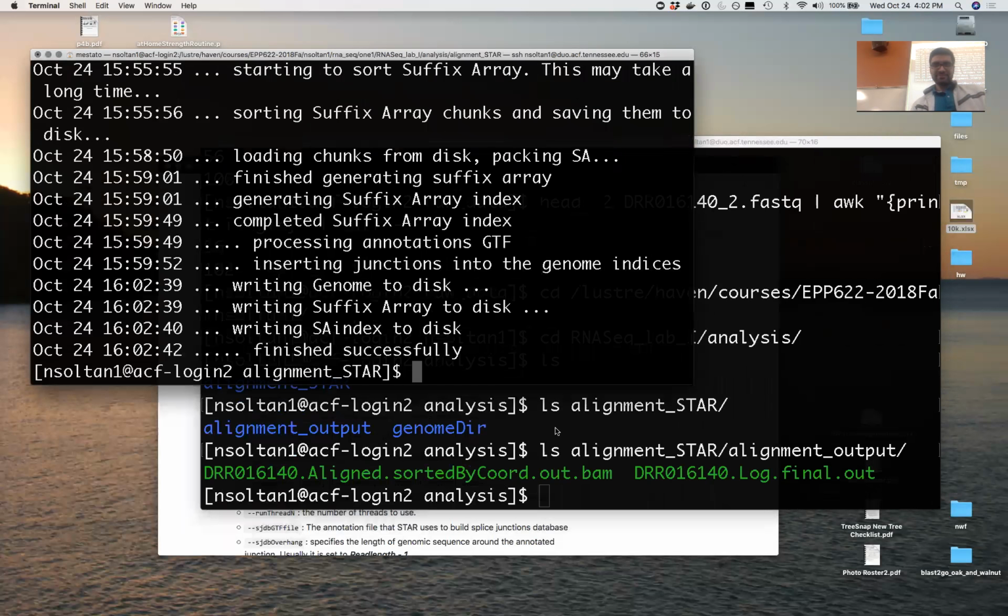Okay, good job. We're finally done with the indices. Students, copy the genome directory. If you already have that interactive session, just copy the directory that I just created for the genome indices. And if you do not have that interactive session, just watch whatever is in here.